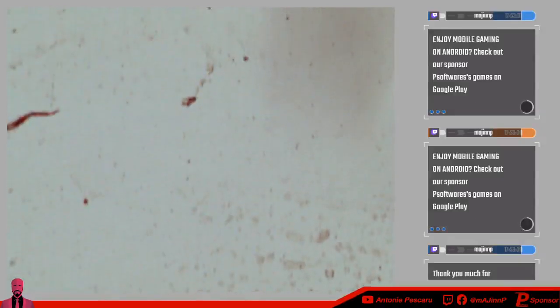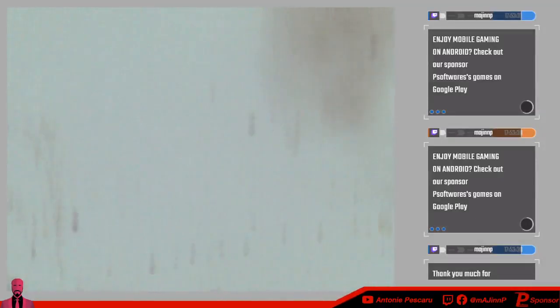Like I said, it takes a while to find, but once you do find it, it's definitely worth looking at. And, oh, I think these are them. These are the cells. I'm just going to see if there's the bunched up kind.